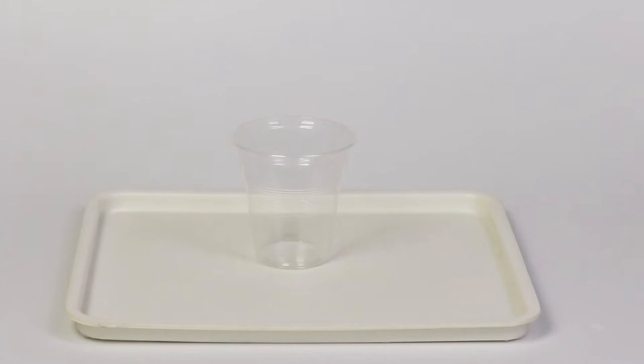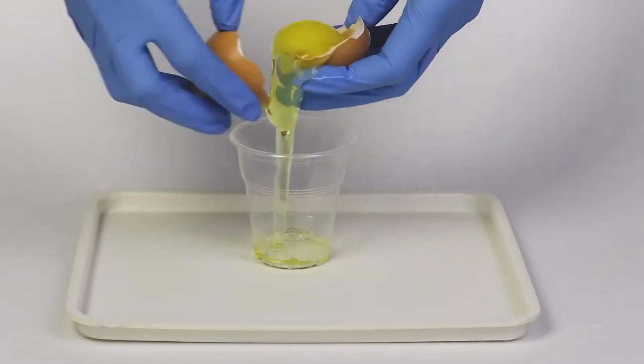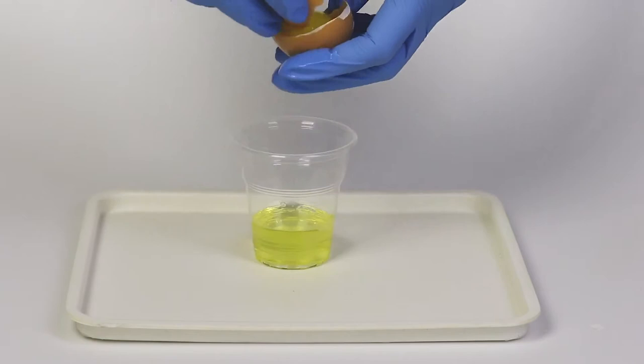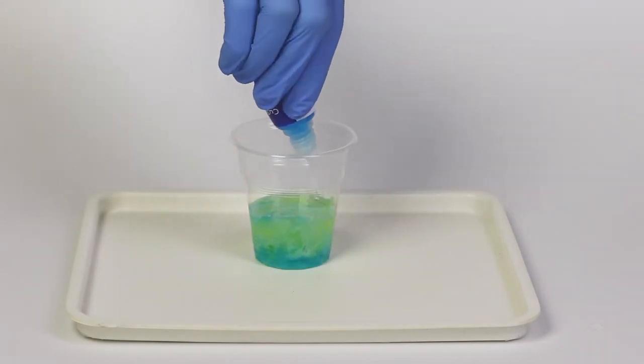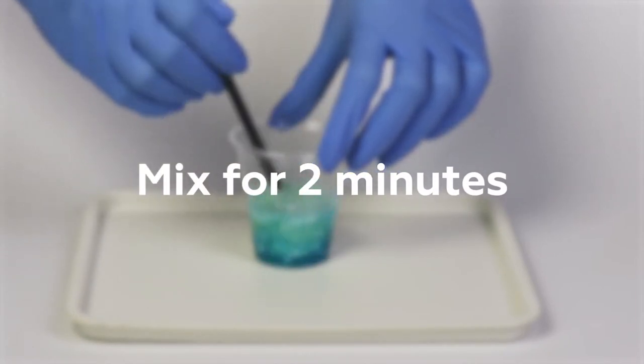First, you must crack the egg and separate the yolk from the egg white. Now take a disposable cup and pour the egg white into it. Add one bottle of copper sulfate solution to the cup and carefully stir the mixture for two minutes.